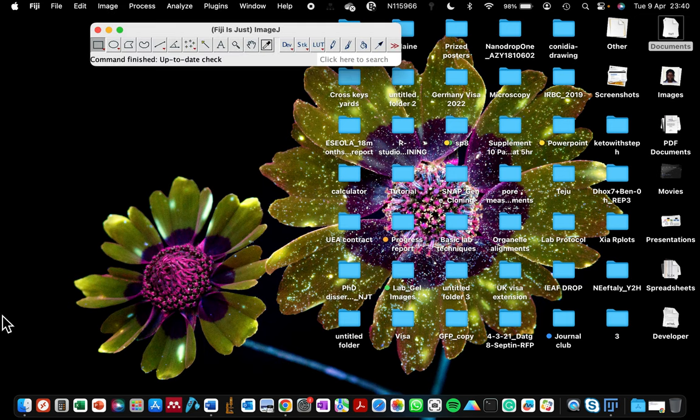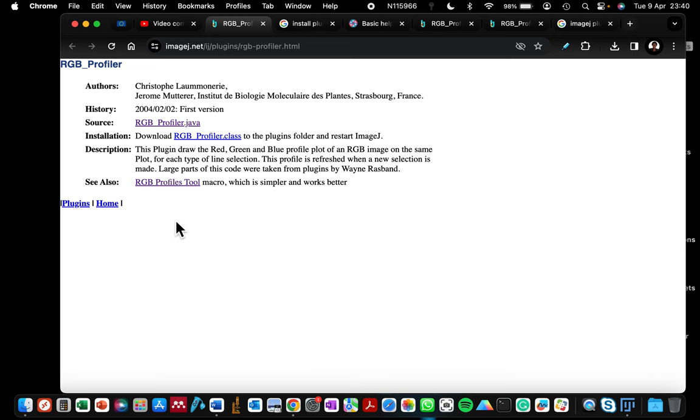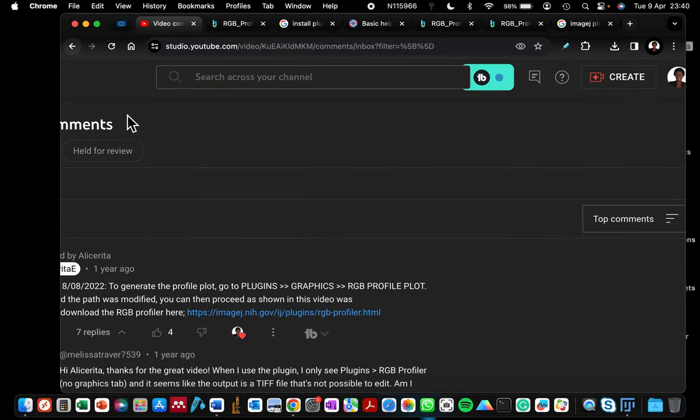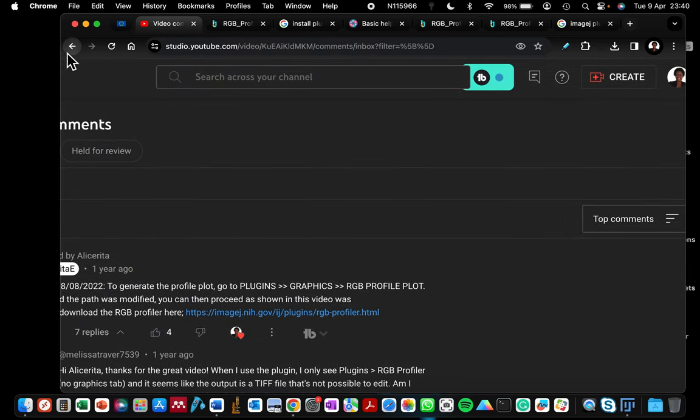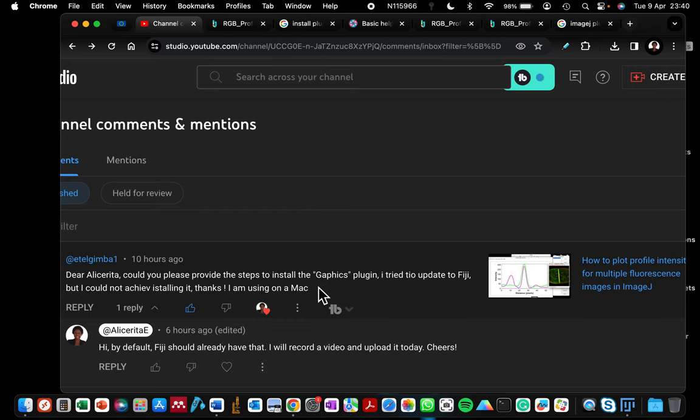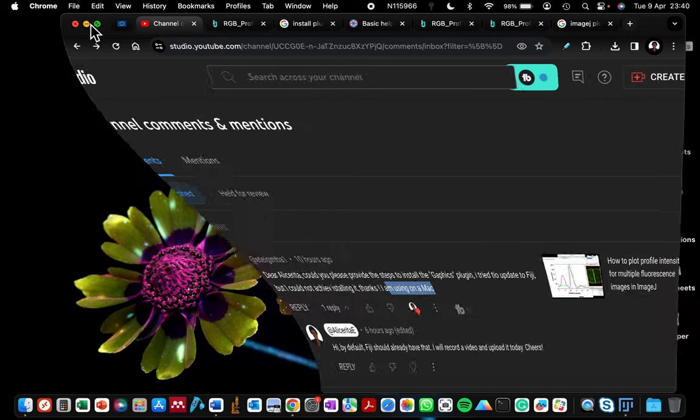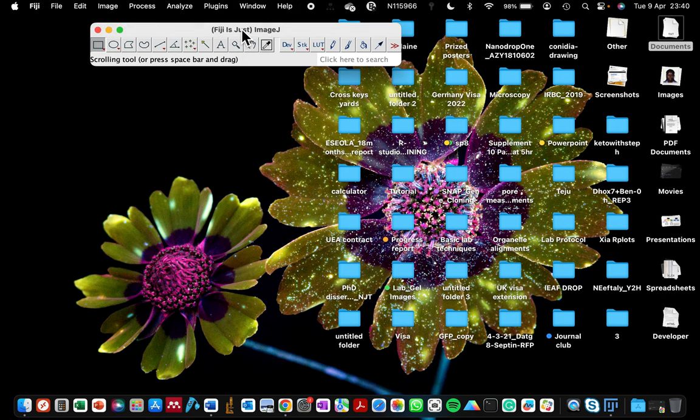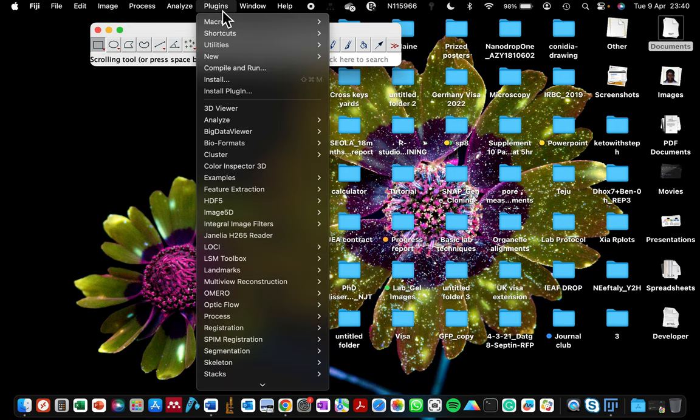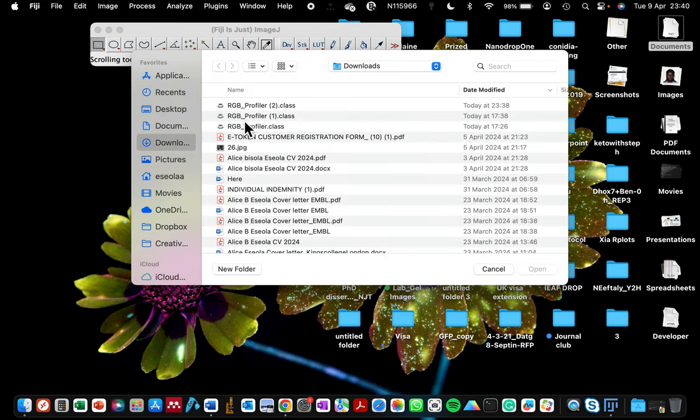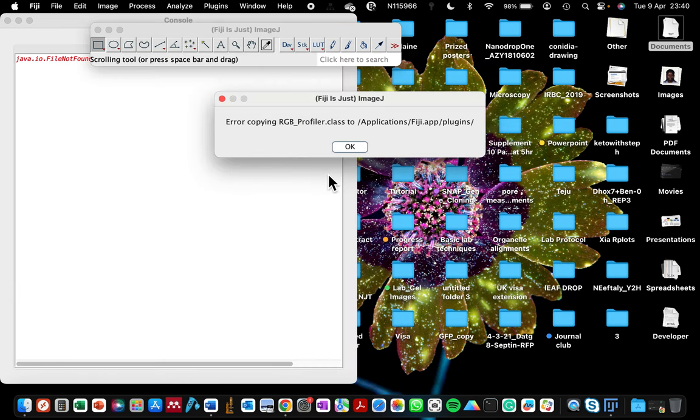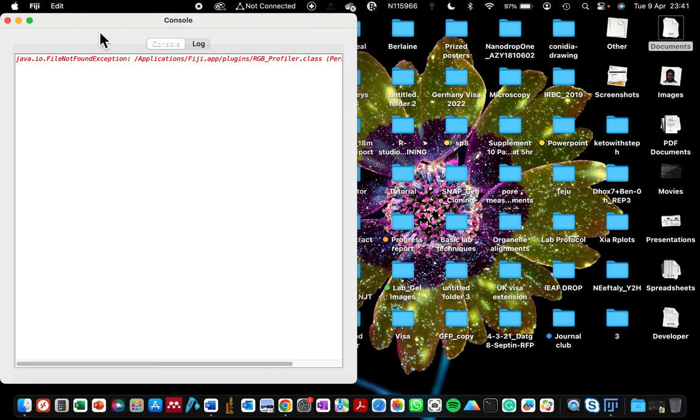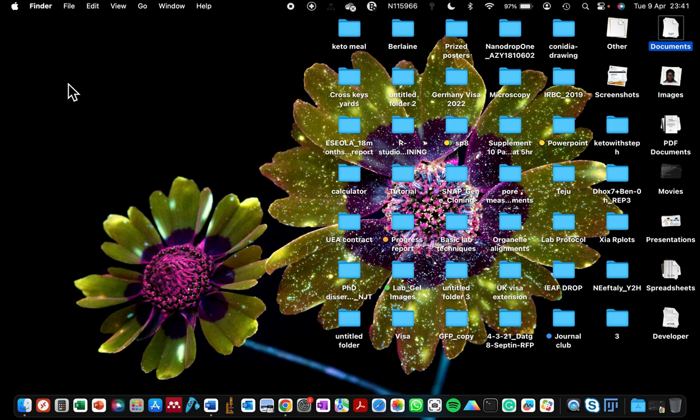They are experiencing difficulty installing plugins in Fiji on their MacBook. Earlier we clicked on plugin, install plugin, and installed our profiler and it gives us this error - error copying RGB class to application Fiji. Earlier when I tried this, it was also including permission denied in the error message.